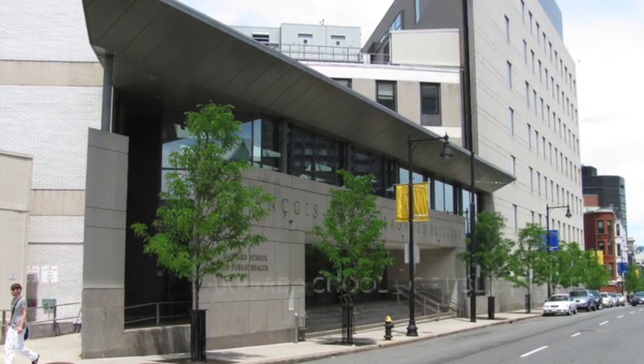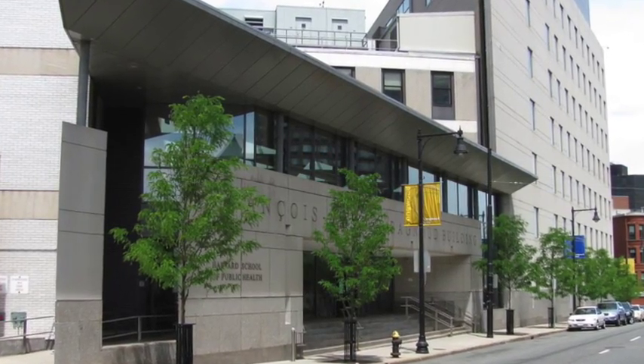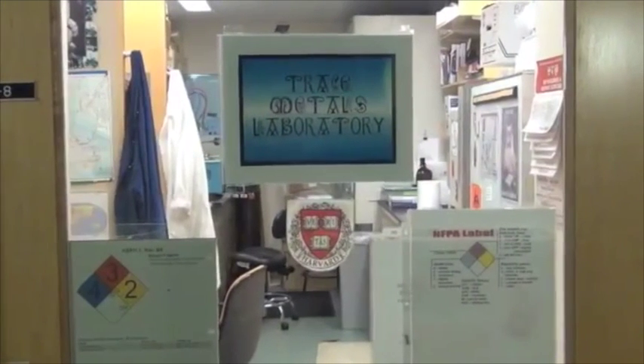Hi, I'm Zhao Dong, a researcher at the Harvard School of Public Health. Today I will be walking you through the steps of mercury analysis we conducted here at the Trace Metals Laboratory for the Grand Lake Watershed Mercury Study.